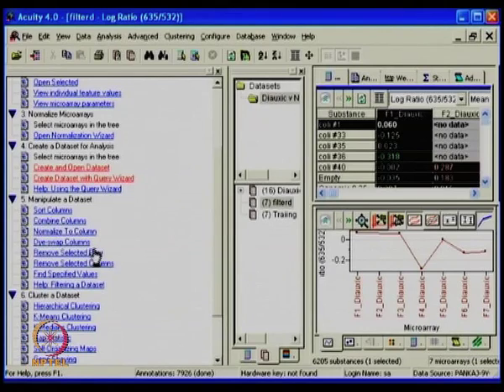We also talked about dye swap, and I was talking to them about dye technology and how one needs to use, in fact, labeling with different dyes and reverse dye swapping so that there is no dye bias in the analysis. True. So the same can be accommodated here in the microarray analysis. That was a very nice part actually to go ahead with.